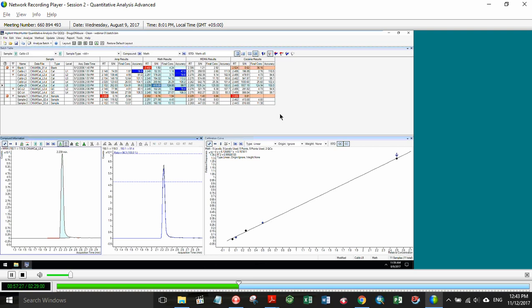Very, very interesting question. Question there. Can we show it in the batch table being exported? Yeah, I am going to have to work on that one as well, Lindsay. Very, very good question. That's good. We got lots of good questions.